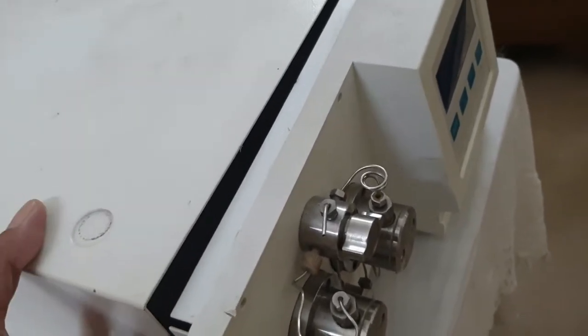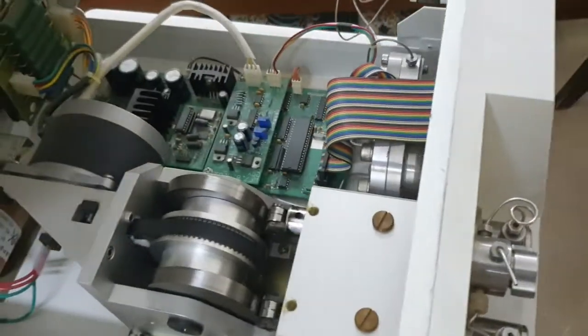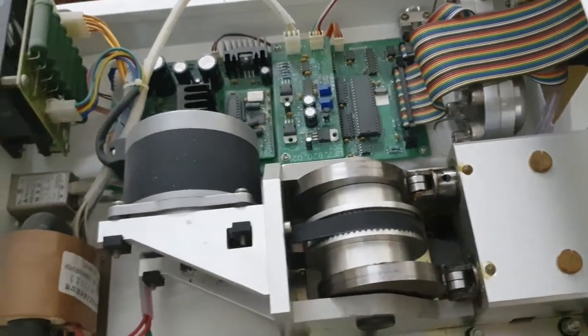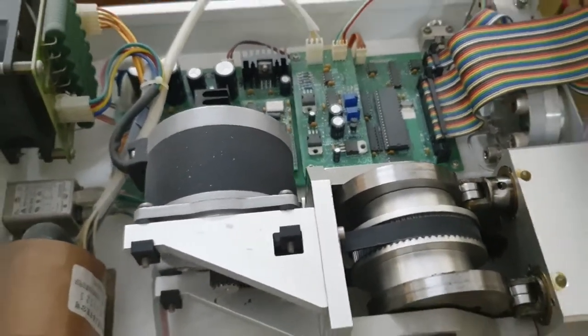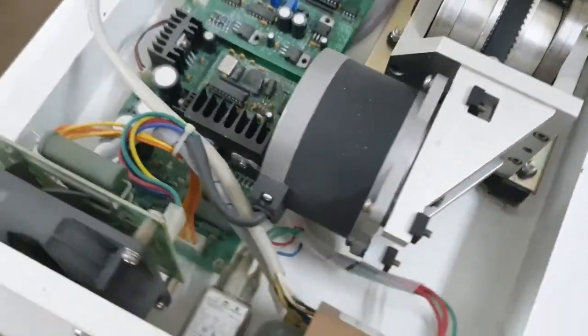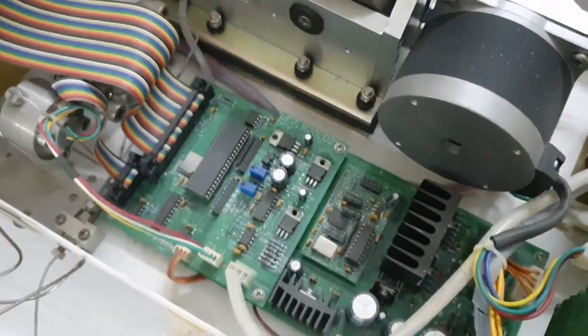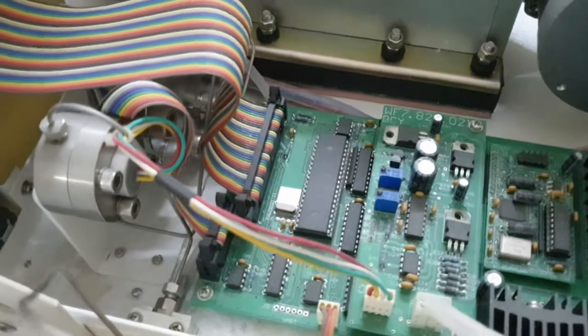After opening all the screws, we will uncover the HPLC pump. This is the inside of the pump — we can see all the parts inside. Now we will look for the indications of leakage from the tubing and different parts.